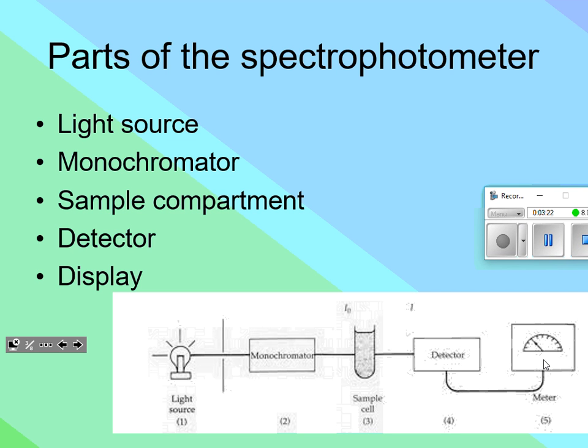So it seems like a fairly simple setup, but because of how sensitive that light bulb is to begin with, and that detection field has to be very good as well at what it does, it is a pretty expensive piece of equipment. That's why we can only have one per lab bench, which means today in the lab and next time we're working in groups of 4. Again, I'm not a huge fan of doing groups of 4 because sometimes we're not all doing stuff, but it's what we got to do with the equipment that we have.